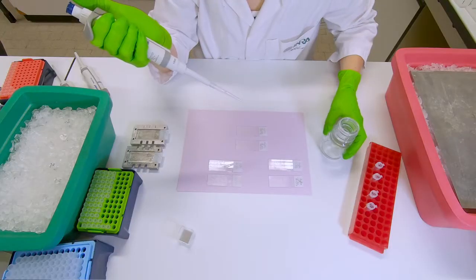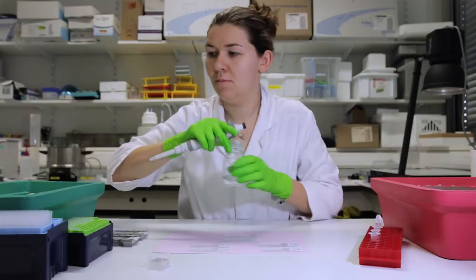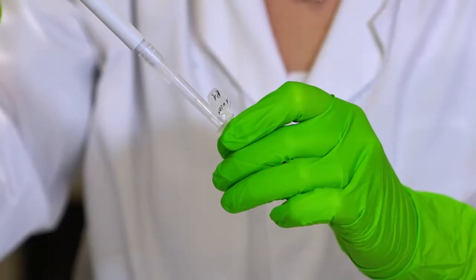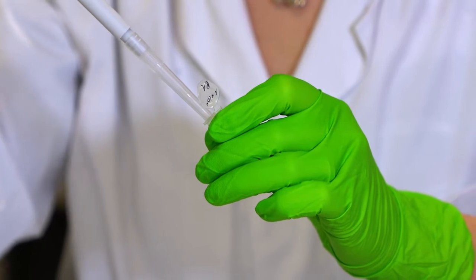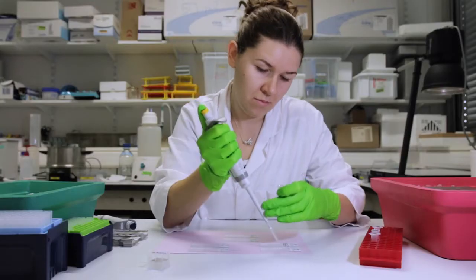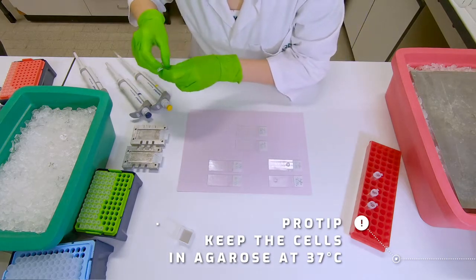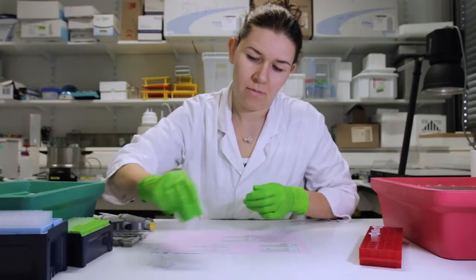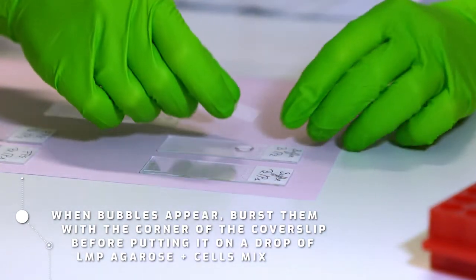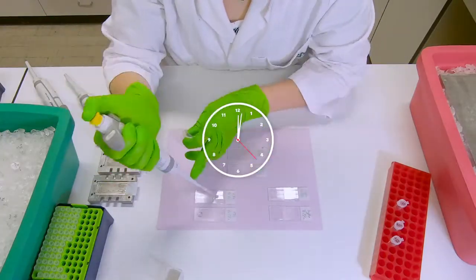Mix the cells with 1% agarose to a final concentration of 0.7%. Then place a drop of 70 microliters of the mix in each of the glass slides, and place the cover slip on top of each drop. Whenever one slide is ready, just transfer it to the cold metal plate to settle the gel, then continue preparing the rest of the slides.